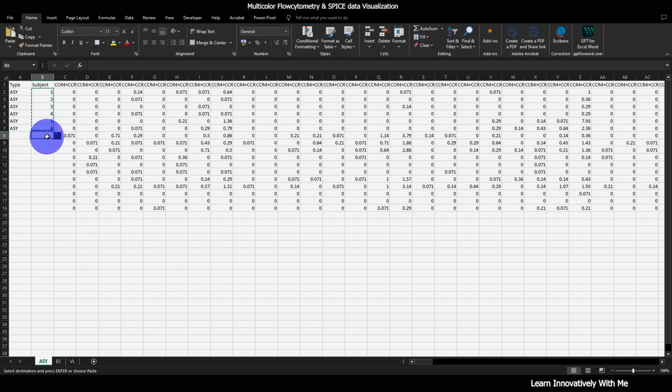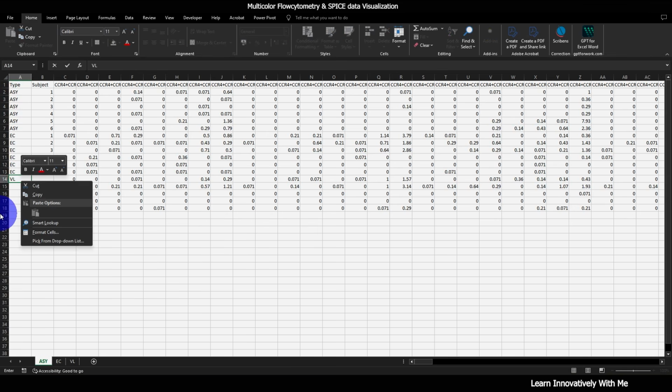I'm going to put the subject number 1 to 6 for the EC, and this is very important. You will get the same nomenclature in the SPICE data that you are putting here. So please take care about this.